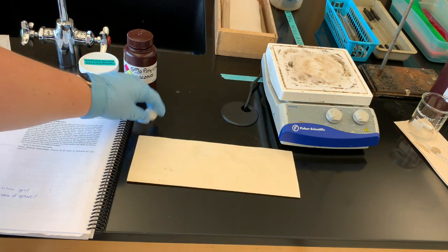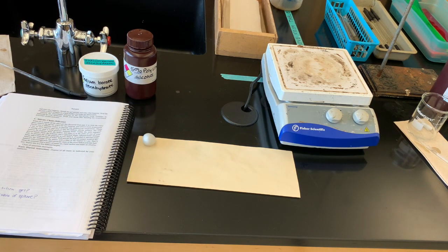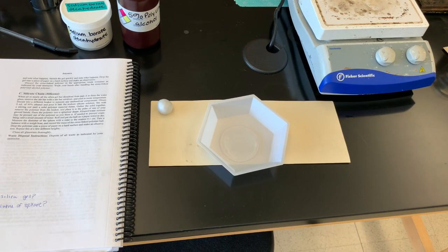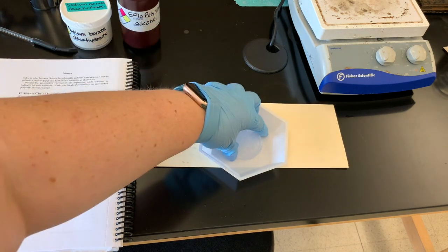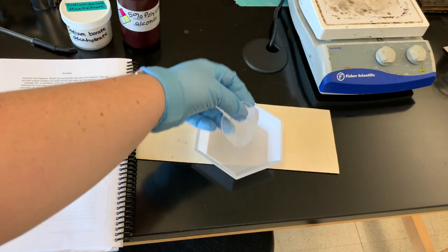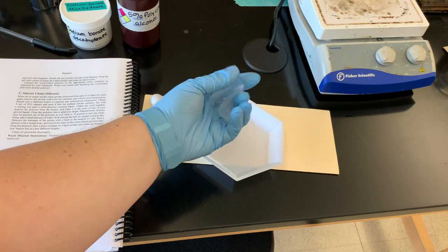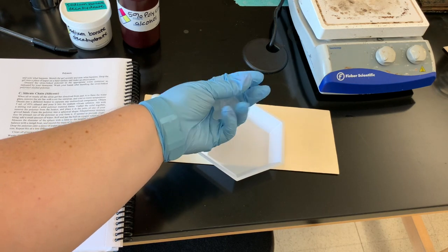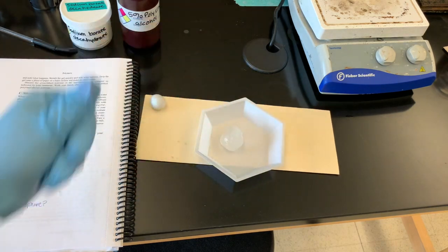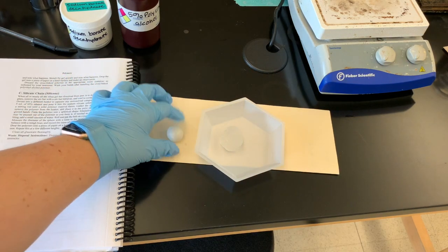We're going to compare that to our cross-linked polymer made with polyvinyl alcohol. When we took the mass of it, it was kind of a sphere — it was sticking to everything, especially my gloves. But now it's been about 10 minutes and it's definitely flattened out. We could not really bounce this — this is not a bouncy ball. It's kind of like a gel type, rubbery feeling. You could make it into a ball again, but it would just kind of fall out and not hold its shape the way our silicone does. It does bounce a little bit, but if you let it sit, it's going to kind of flatten back out.